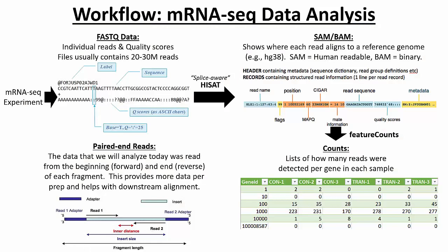So first of all, I'd like to give you an overview of what this process is actually going to look like, since by the time we jump into Galaxy, it's just going to be clicking a lot of buttons and putting names in fields. Okay, so this is what we're actually doing at the granular level today.